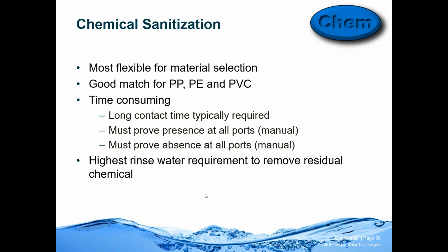The polypro is the most common in distribution, and the time you're going to manually open each port, use a test strip or some means to prove the sanitant is there, and then after the hold period, all of those ports are going to have to be rinsed with testing to demonstrate that the sanitizing agent is gone, or again, if it were present, even if it didn't ruin the product, it would be a violation of no added substance to have an antimicrobial agent in your finished water. So it has to be rinsed out, and that's typically a pretty high rinse volume.